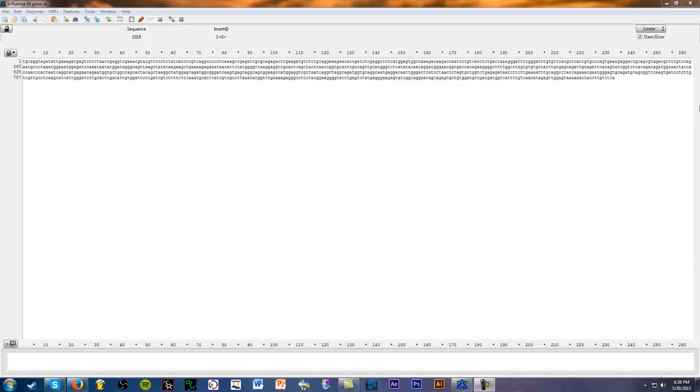So today I'm going to go over some more details regarding APE, the free DNA editor that I introduced to you guys last week.